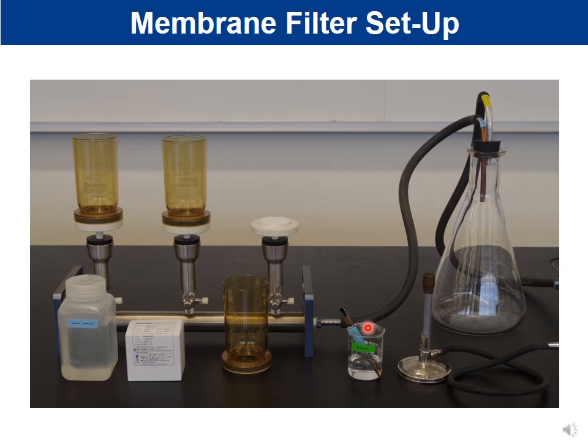And so when your forceps cool down, once they've been sterilized, then you would touch the forceps and pick up the nitrocellulose. And you would place the nitrocellulose on this little setup. So this little platform here has a place that has pores that will allow the vacuum to pull the water down.